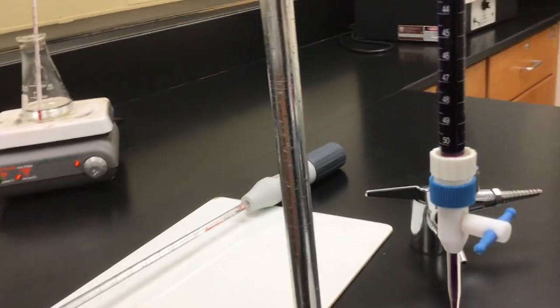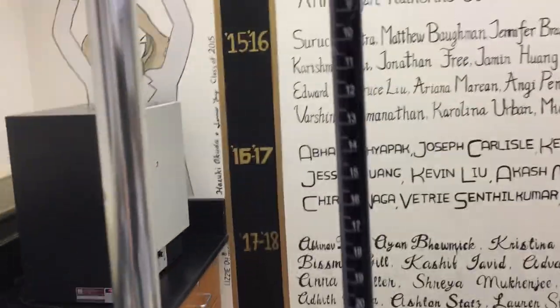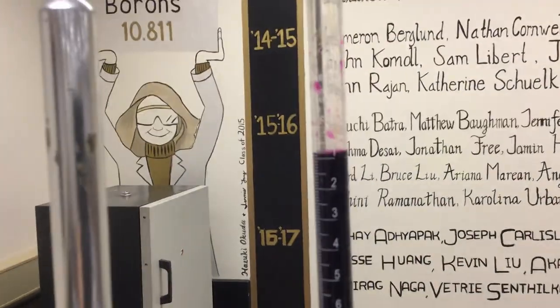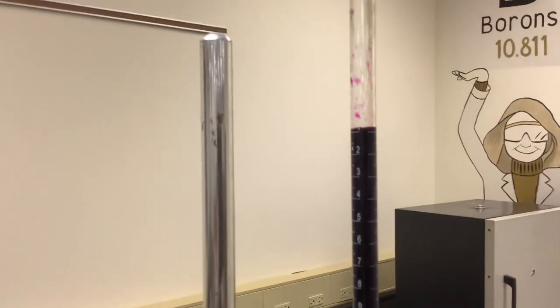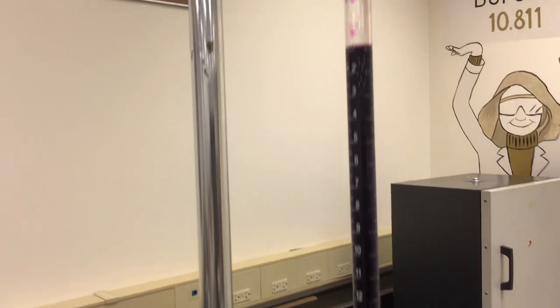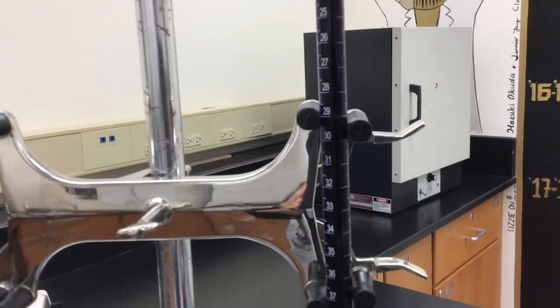And then keep in mind that the markings on the burette, the 50 is at the bottom and the zero is all the way at the top, which is a little strange for most people. They wonder why isn't zero at the bottom and 50 at the top.